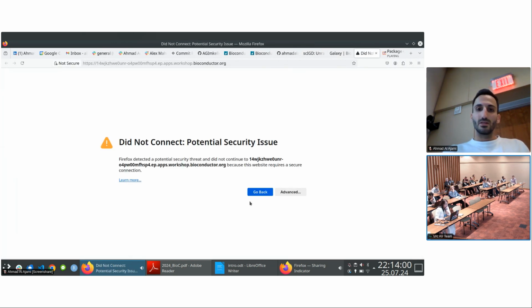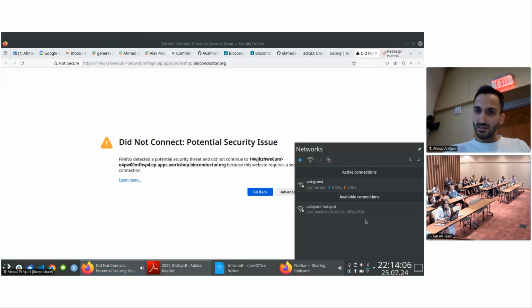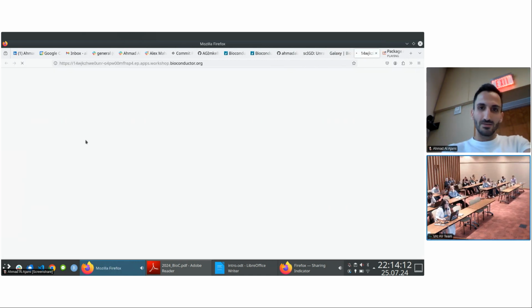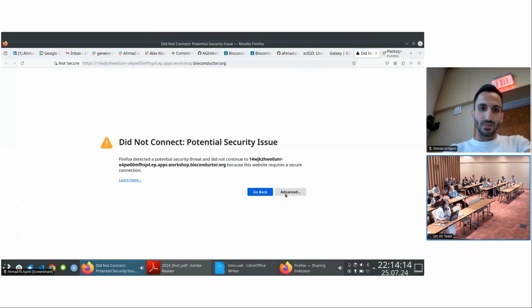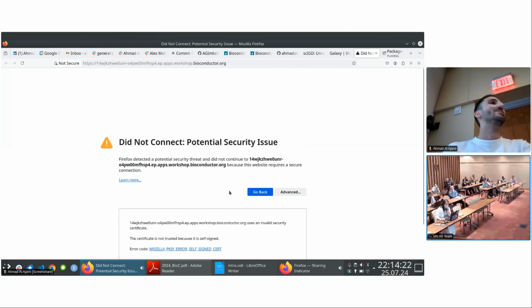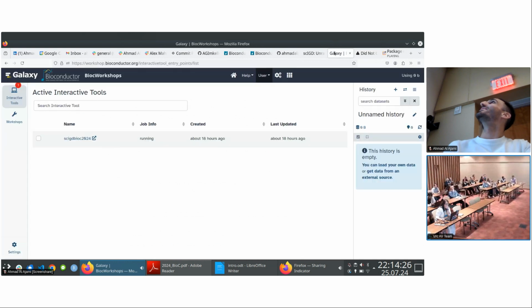I already loaded this, or did I not? Did not. All right. Anyone has an idea here?